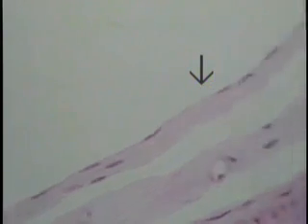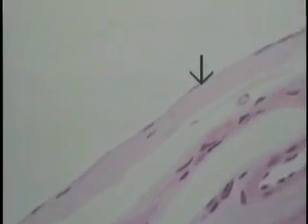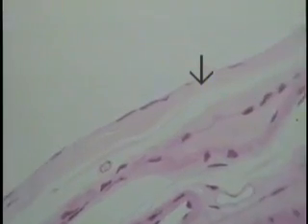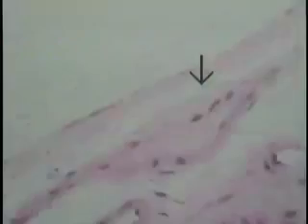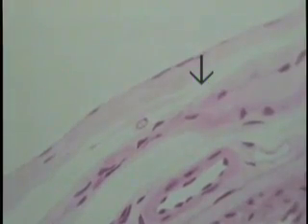Let's trace it by moving the microscope a little bit and get a slightly different field to examine.